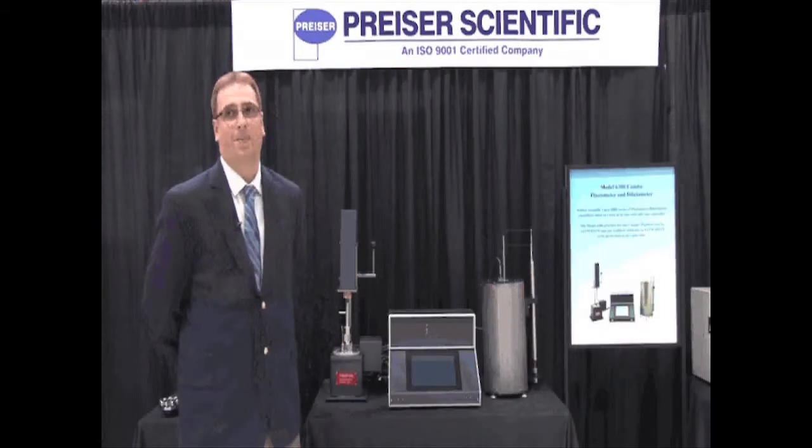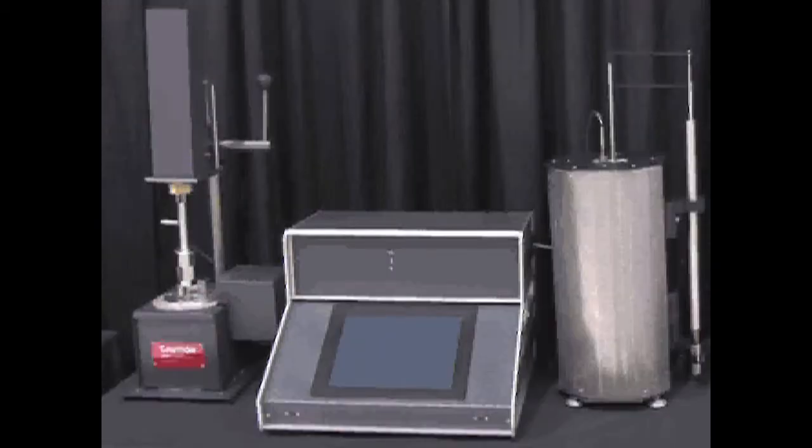It has a Windows-based operating system. It has real-time data being displayed on the screen at all times during the test.